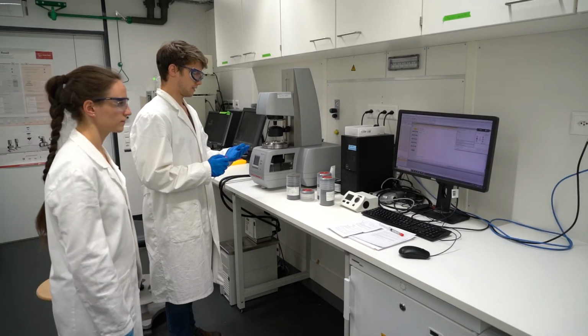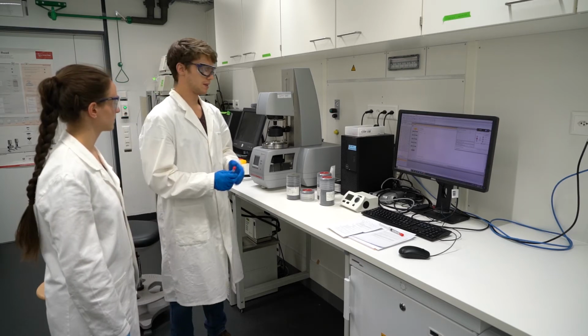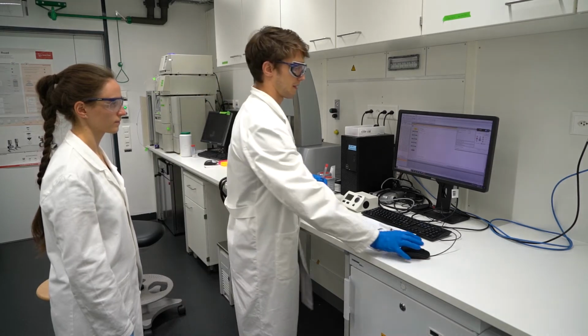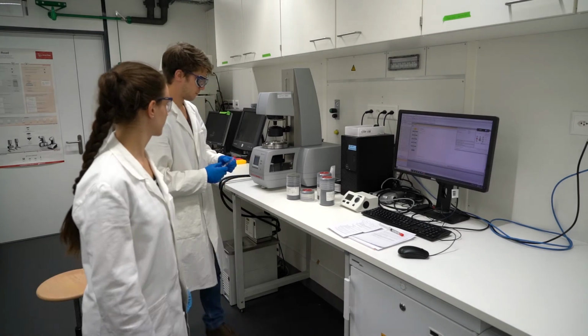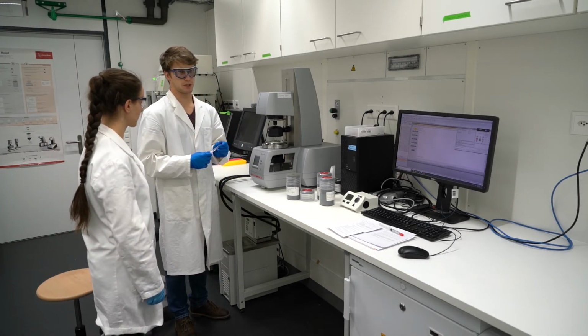Once the zero gap has been set, we can then load our sample between the two geometries. This point is important to match more or less the exact volume we need, so that we don't waste too much material.